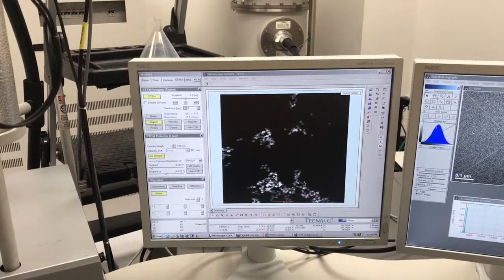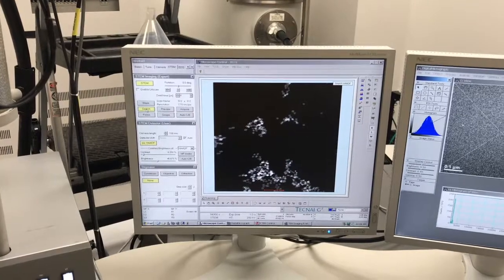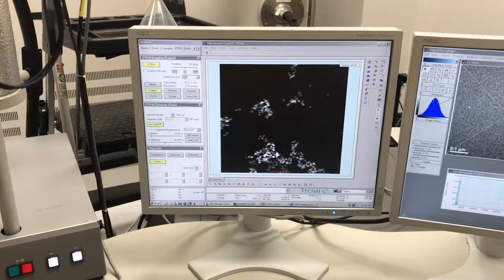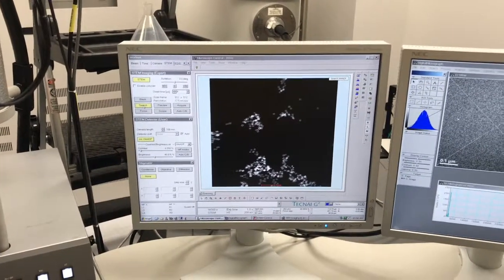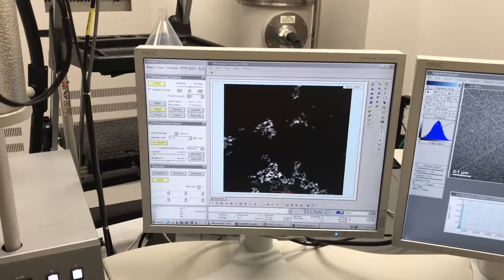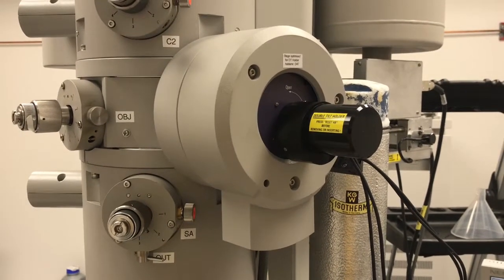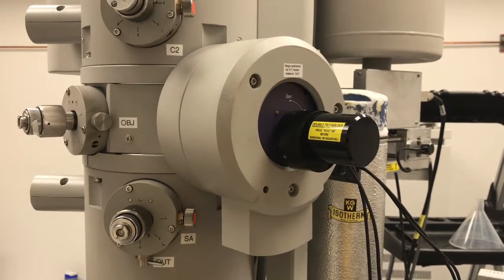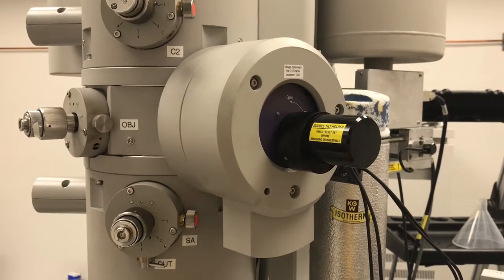In this demonstration we're going to be discussing spectrum imaging using EDS. A few things to consider when performing spectrum imaging, whether that's with EDS or EELS — unfortunately we don't have an EELS system, so I can't cover that. If you're doing any type of spectrum imaging, you want to make sure you have a clean specimen, so if it's possible always plasma clean your sample ahead of time. We are using the double tilt holder, which is optimized to provide line of sight to the EDS detector. You can still do EDS with a single tilt holder, but there's an adjustment you have to make.